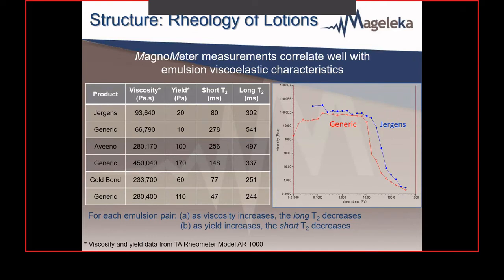Rheology is the science of the deformation and flow of matter under the influence of an imposed mechanical force. Okay, it's a subject of tremendous technological importance. Not surprisingly, then, understanding and measuring the characteristics are of economic interest. So here I want to simply show how NMR relaxation can be used as a tool to rapidly screen the rheological characteristics of emulsions.